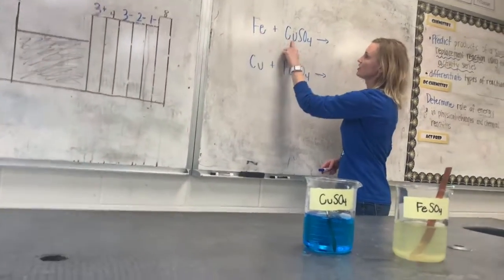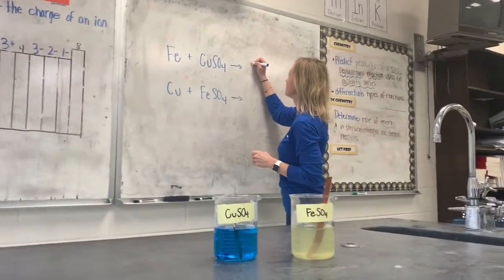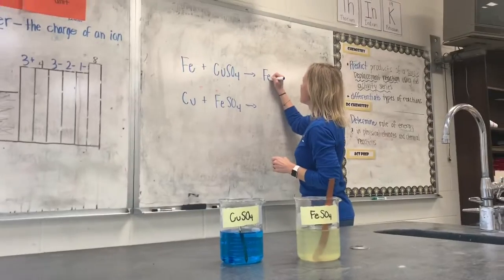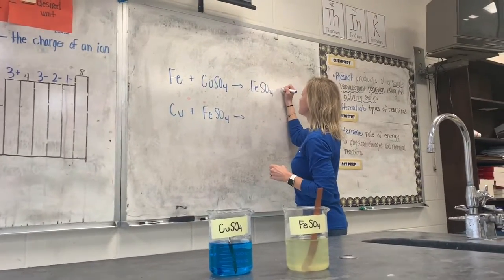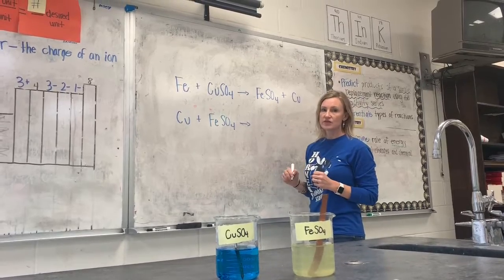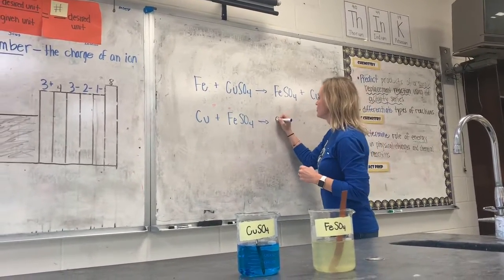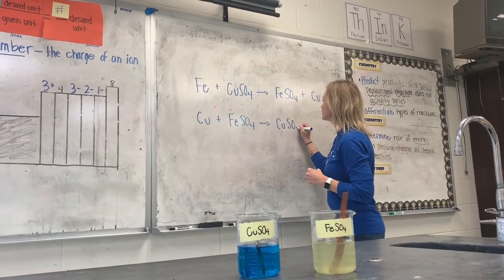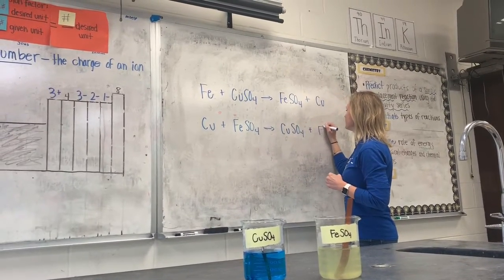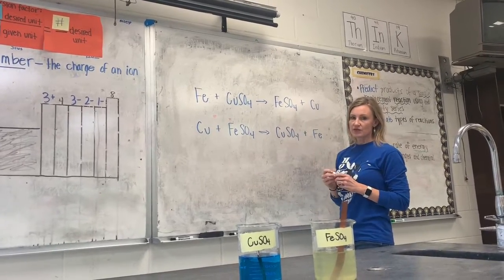And if you remember from before we left, a single replacement reaction would be where this metal, iron, is singly replaced with this metal. And so what you would see is iron sulfate and copper. That would be the products of the single replacement. And in this one, the copper is replaced with the iron, so that is copper sulfate and iron. Those would be the products of the single replacement.